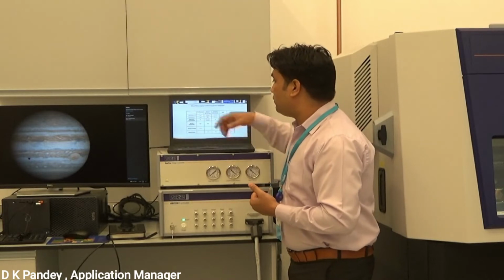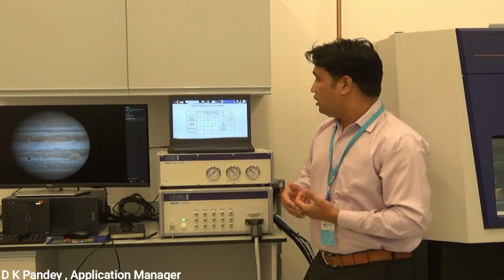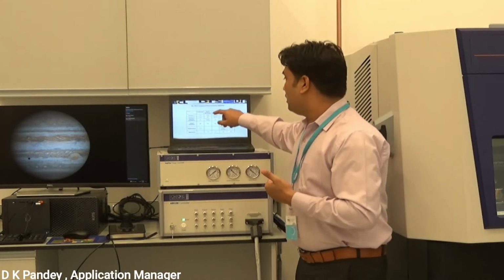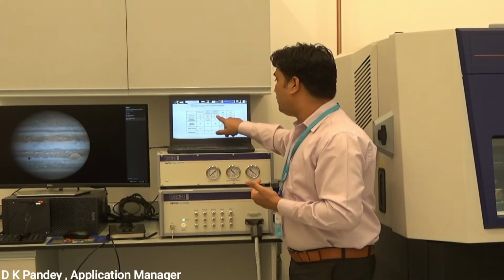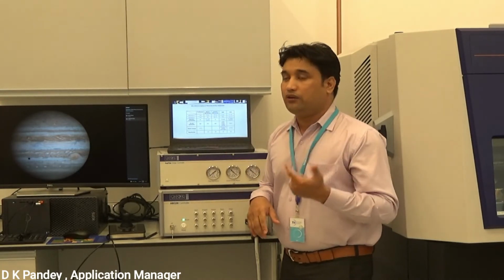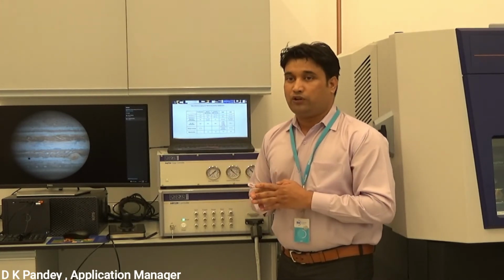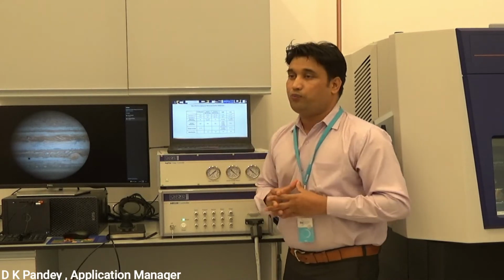If you discuss the resolution in terms of small molecules, the profiler can look up to 1 micron. Optical can go up to 0.5 micron. The confocal microscopy goes up to 170 nanometers. SEM can go to 2 nanometers, but 2 nanometers is a big challenge for them. The general SEM can do only up to 10 nanometers, but AFM can go to 0.1 nanometer.